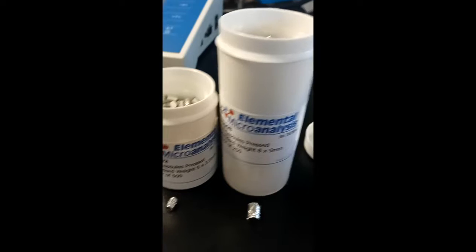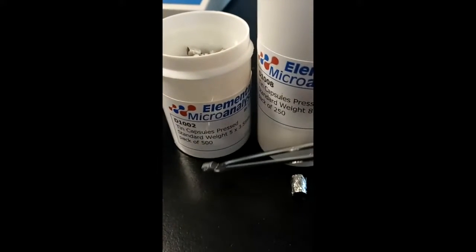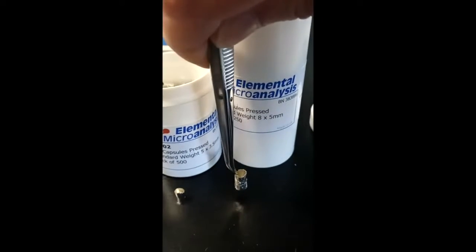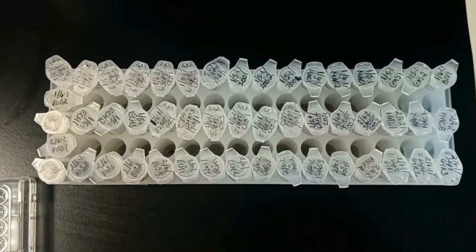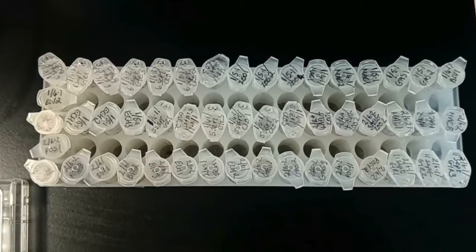These are the two different sizes of tin cups that we're going to be using to put our samples into. The smaller cups are for the 2 milligram samples, which is what the majority of our samples will be weighed out as. The slightly larger cups are for the 4 milligram samples, which are the weights used for samples containing primary producers.